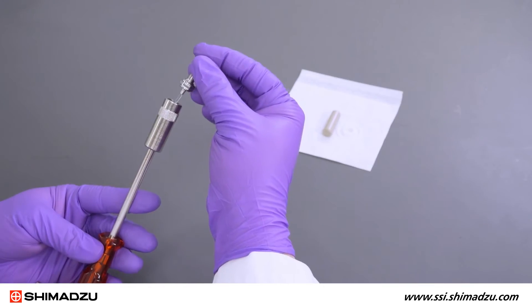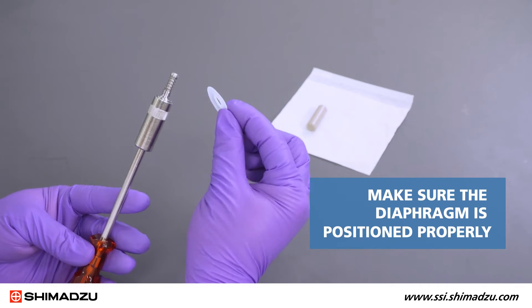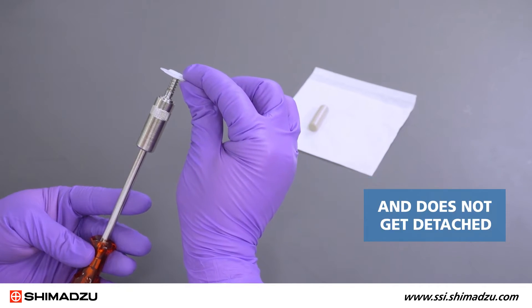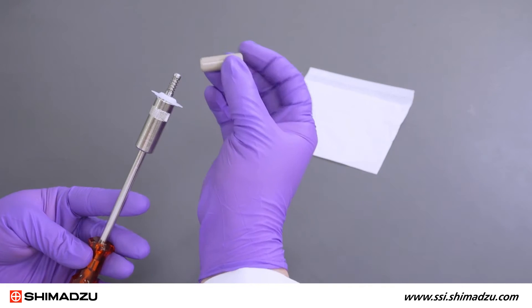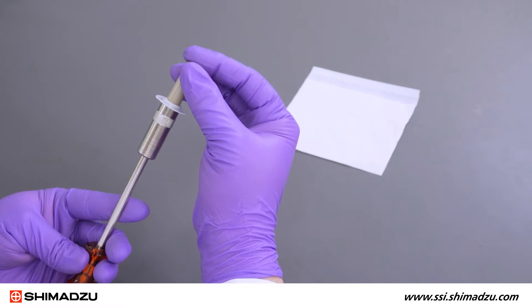Attach a new diaphragm to the new plunger holder using the diaphragm jig. Make sure the diaphragm is positioned properly and does not get detached. Press firmly to secure the diaphragm to the back of the plunger holder.